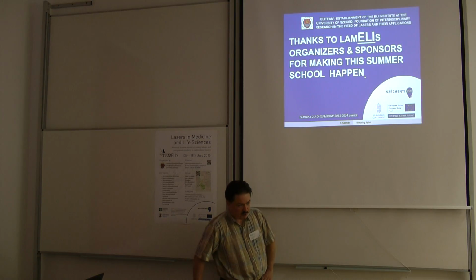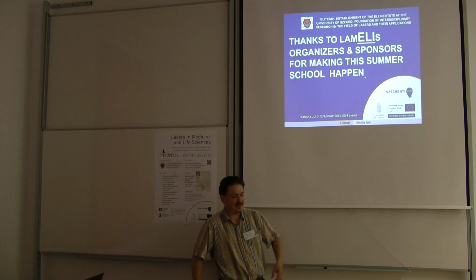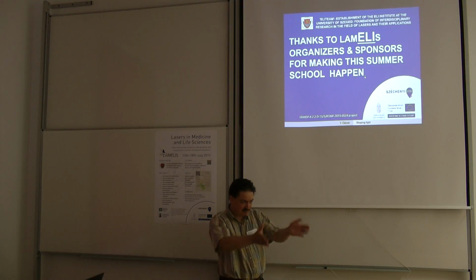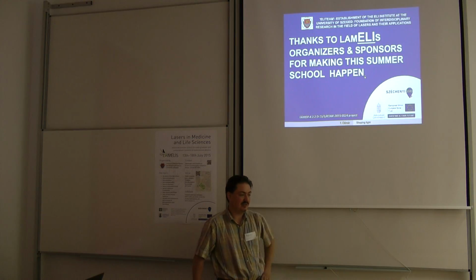Well, for optogenetics, you basically shine light on a couple of neurons and, using channelrhodopsin, you change the behavior. You start artificially firing the neurons. If you use single mode fiber, you have nice output and you can basically illuminate quite a zone as you go in depth. The multi-mode fiber would allow you to specifically target individual neurons. You could shine on one of them only if you want, to select which one to address.